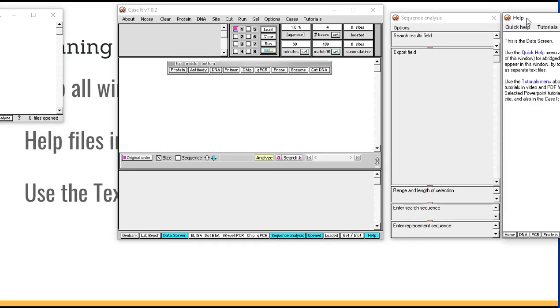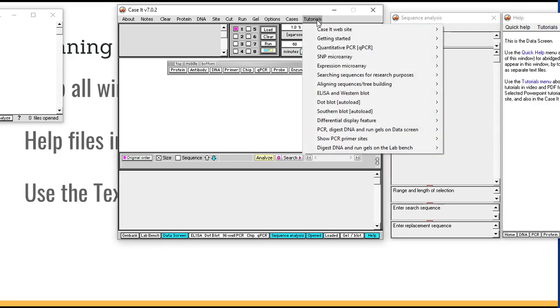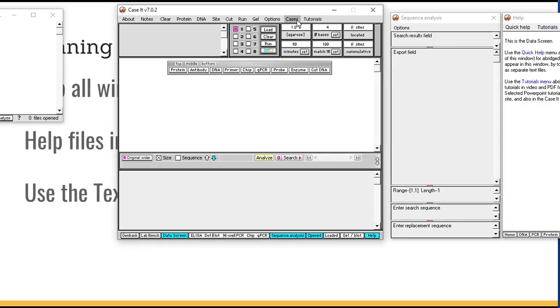I recommend that you keep all 4 windows open and visible while running the program. Once you begin, if you feel that you have skipped a step or made a mistake, you can always start over. Once you get the hang of using the software, it shouldn't take you too long to repeat your experiment. However, there's a bit of a learning curve to become familiar with the program, and we're taking 2 units to perform 1 case.